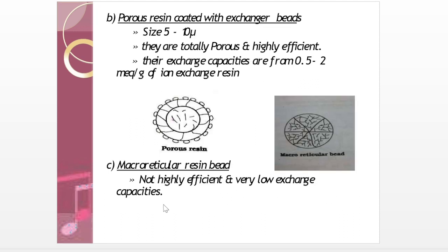Porous resin coated with exchanger beads. Its size is 5 to 10 micrometers. They are totally porous and highly efficient. Their exchange capacity is from 0.5 to 2 milliequivalents per gram of exchange resin.